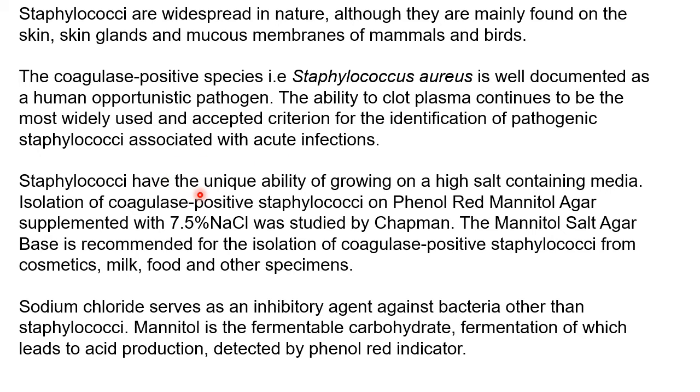Now, the staphylococci have the unique ability of growing on high salt concentration media. The isolation of coagulase positive staphylococci on phenol red mannitol agar supplemented with 7.5% of NaCl was studied by Chapman. The mannitol salt agar base is recommended for the isolation of coagulase positive staphylococcus from cosmetics, milk, food, and other specimens, as I told you. So that's the reason why mannitol salt agar is important, as it is used widely for the isolation and identification of pathogenic Staphylococcus aureus. Okay, so this is important.